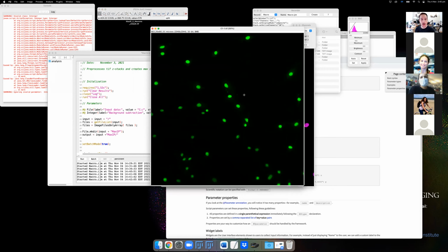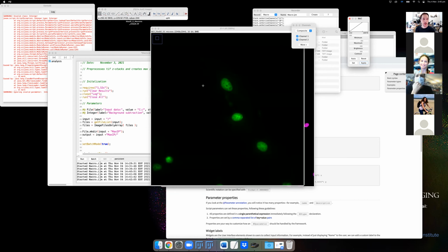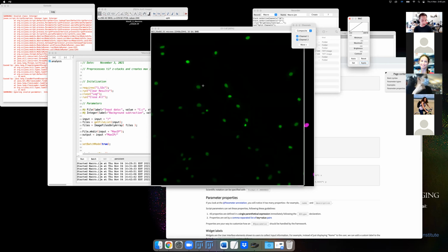Okay, so these are the global marker. The first thing that we do to make these problems easier, if we zoom in, is notice there's some texture in these cells. It might be some background. So if we try to just straight away apply a threshold, you can bring up the threshold tool by using Control-Shift-T.